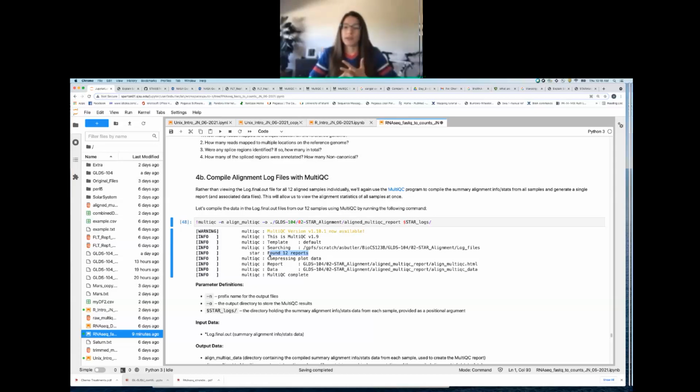If you remember in the FastQC files, when we compiled those, how many reports did we have? 24, yeah. So we had 24 then. Why do we now only have 12? Any guesses? You guys can unmute your mic.